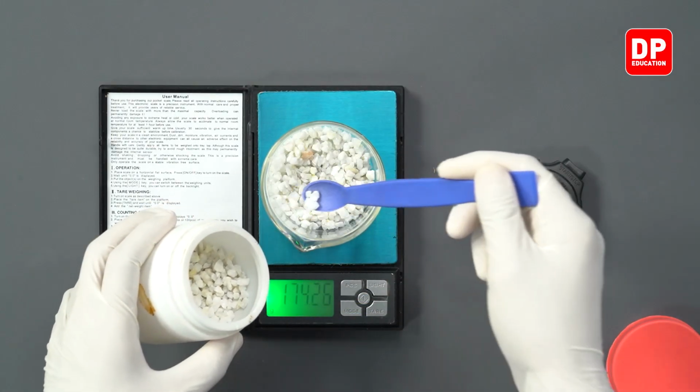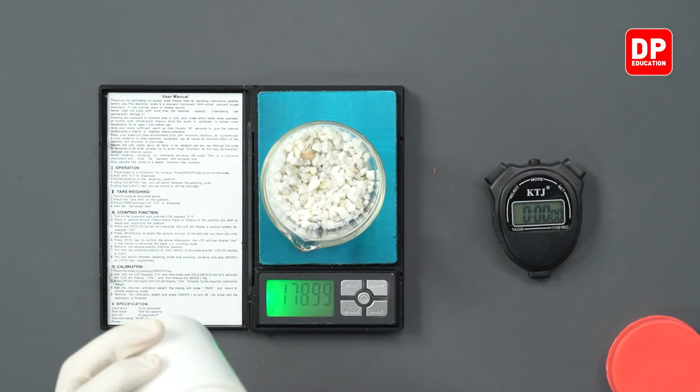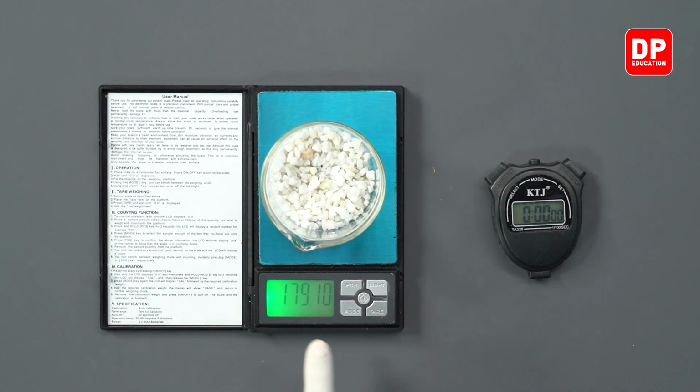We have measured a little bit over the required weight. So students, now we have measured 179.10 grams, indicating that we have measured exactly 100.04 grams of calcium carbonate. You can see the final weight is 179.10.